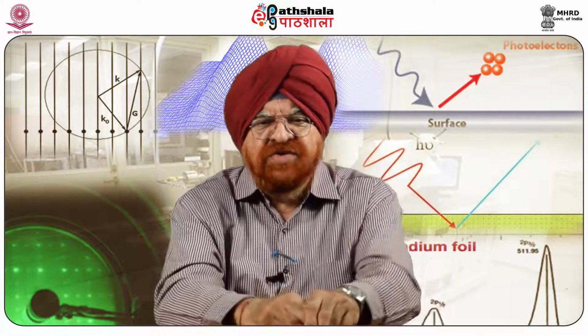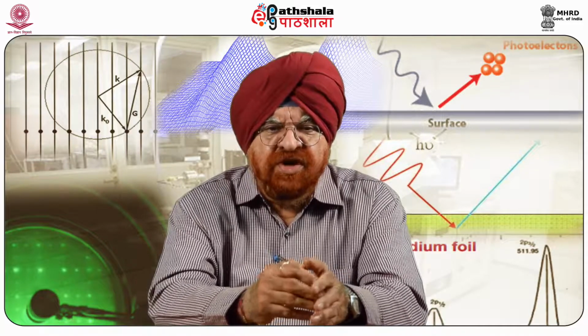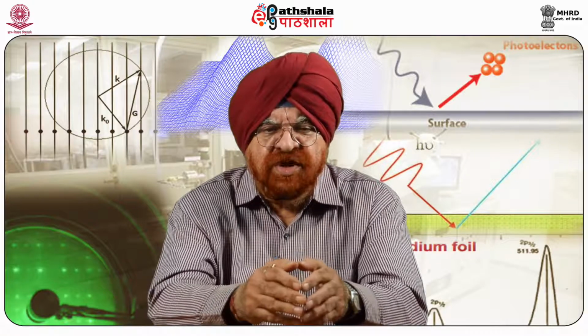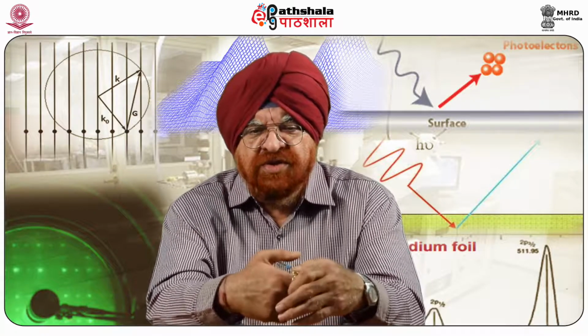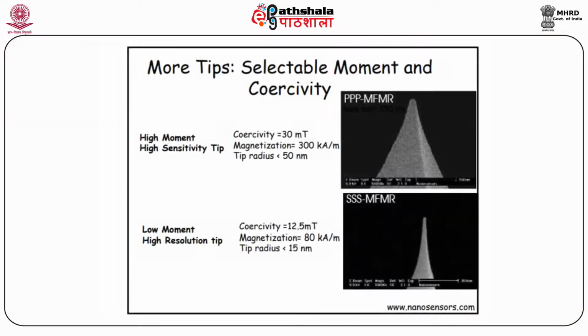In the present chapter, we will also demonstrate some applications of the technique made by our research group in the study of magnetic vortices formation in sub-micro-sized structures, as well as further magnetic properties of silicon and germanium-based magnetic semiconductor thin films. More tips on selectable moment and coercivity.